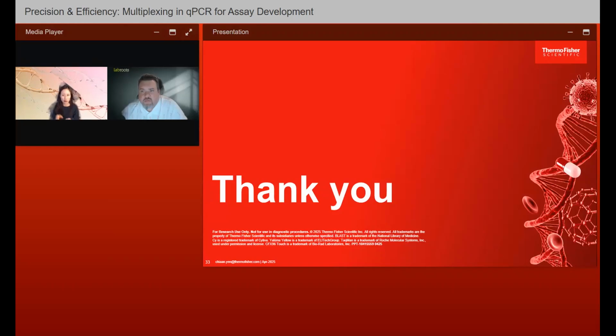They will probably have different introns spliced out, so you can definitely utilize that to your advantage and design something that will sit in the exon to exon junctions. You have to look at the variants: all of them have these exons with the introns spliced out, but some of them will have maybe exon 1 and 5. I'm just making up things, 1 and 5. It could be 1 and 3 that's combined. Then you will design a sequence that's in between a junction to ensure that you can detect the different splice variants. But yeah, I think that's doable.